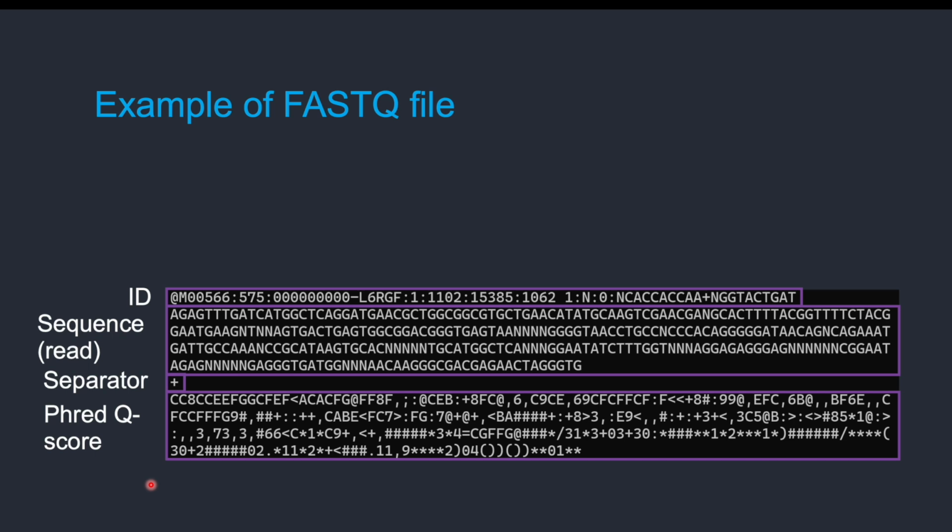the quality score. Phred quality score or Q score is the single letter representation of the error rate for each of the bases. DNA sequencing machines do make mistakes during base calling. Therefore, those single letter quality scores represent the probability of incorrectly identified bases by a sequencing machine. I have made a separate video on Phred quality score. Please check out my video.